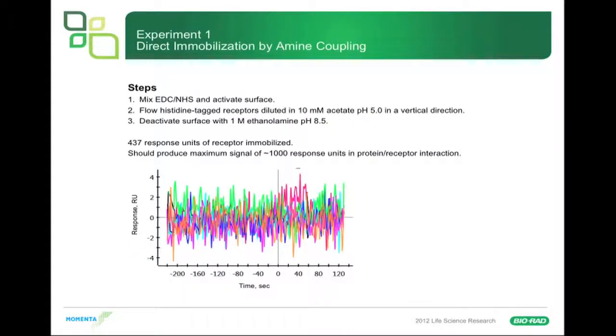First, we didn't try it with the HTG chip right away — we tried it with a normal carboxymethyl dextran chip, the G chip. We mixed EDC and NHS to activate the sensor surface and tried to directly couple the receptor in acetate pH 5.0, then deactivated with ethanolamine. We got a lot of receptor on the sensor surface — 437 response units, which should have produced a maximum signal of a thousand response units, way more than we needed. But instead we got nothing. Immobilization killed the receptor, so we couldn't use that approach.